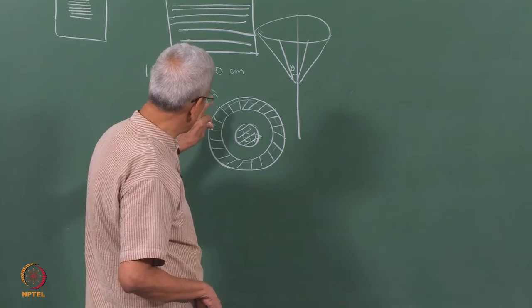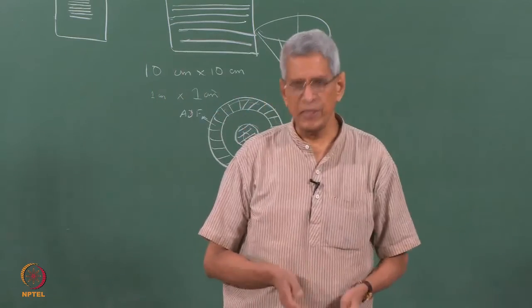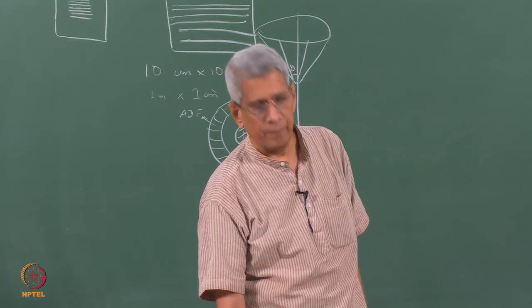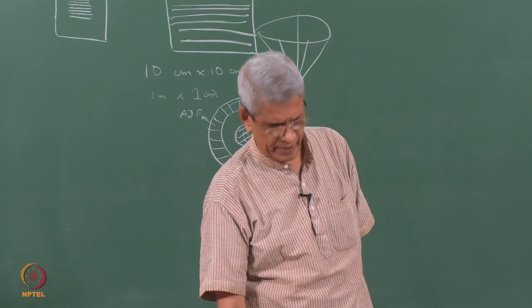the diffracted beam which is scattered into this annular detector, okay, all of them are collected together simultaneously, and because of that, compared to a conventional diffraction pattern, okay, we could get in the dark field a much better contrast.